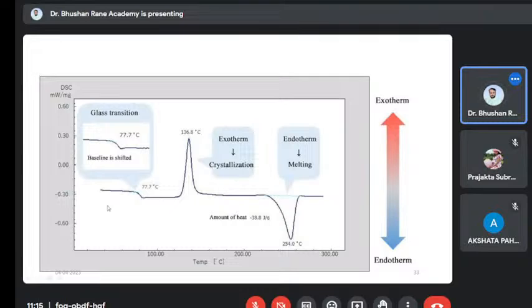So here, for exothermic crystallization, the peaks are positive, and for endothermic melting, negative peaks are observed when we plot milliwatt per milligram versus the temperature. In some cases, the plots are inverse, so that exothermic is a negative peak and endothermic is a positive peak. In that case we have to check what is on the y-axis. Okay, it may be a delta H value.